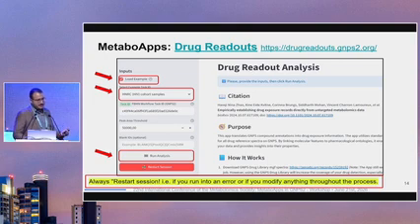Because as it is an online server, anything can happen to your connection. So just to avoid any mistakes, restart the session if you select a different threshold, if you select a different code for samples, or if you do some refinement that I'm going to show right now.